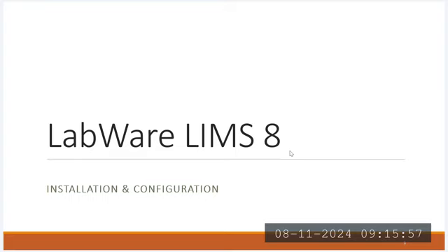We are not going to perform any LIMS installations as part of the training, because we don't have any installation activity. Just how to proceed with installation and what prerequisites need to be ensured, such types of activity we will discuss thoroughly in going-forward sessions. Once I get the confirmation, I will start the further sessions separately.